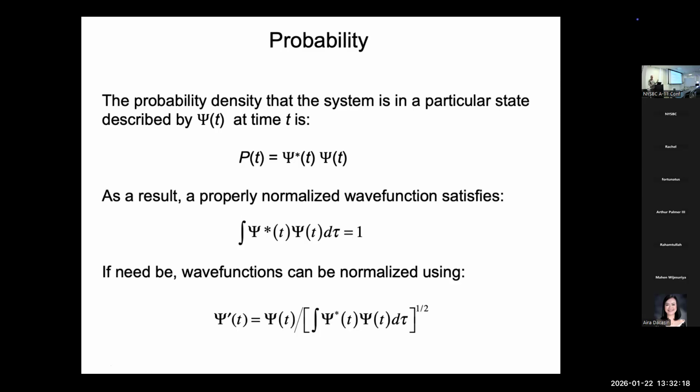That said, many of the things that we use in NMR aren't normalized to 1 because that just introduces a whole bunch of inconvenient factors of square roots of numbers. So what's important to us generally is everything is going to be normalized to the same number, which may or may not be 1. And if we need to, we can always renormalize. But having everything normalized to the same number is important.